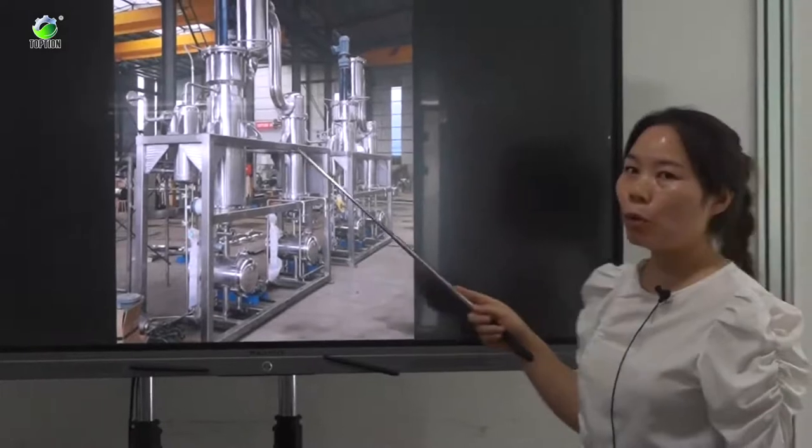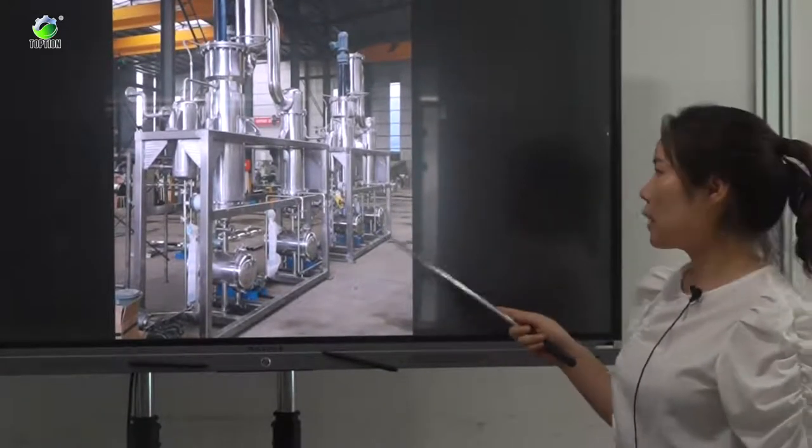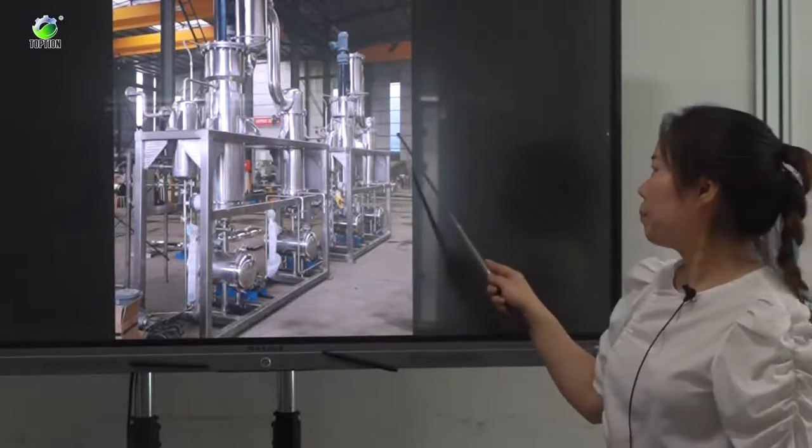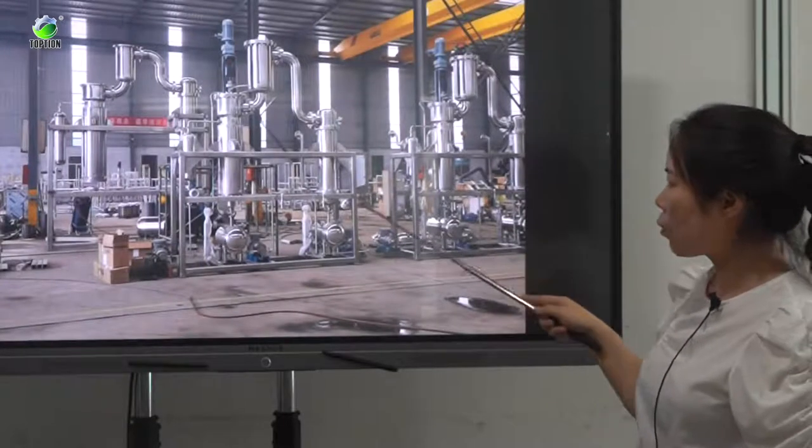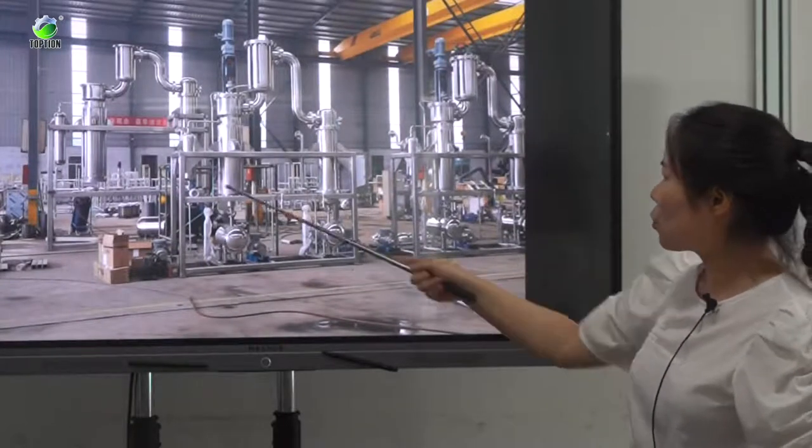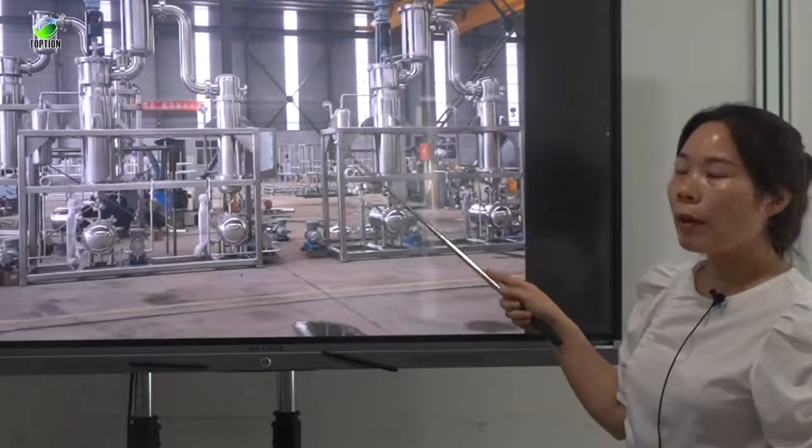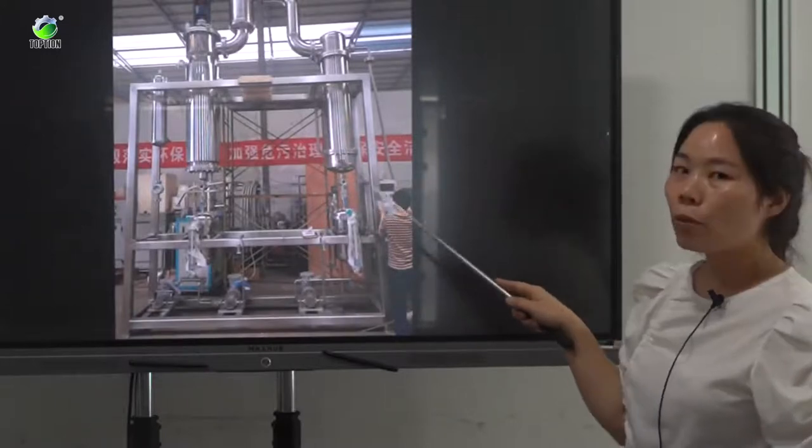Here are some photos of our shipped products of wiped film evaporator. This is the one square meter. This is also one square meter. And this is two square meter. And this is larger three square meter.